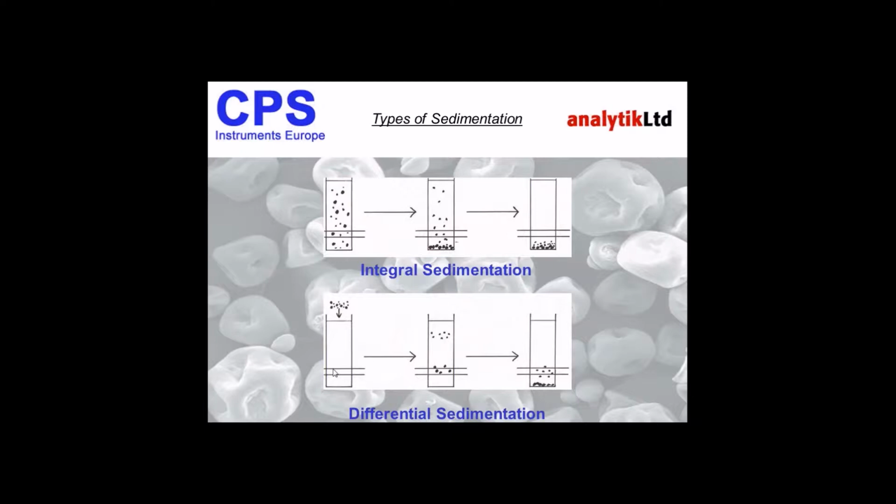Here, the intensity of the source signal is high at time zero, but as particles sediment and go in front of the light source detector, we reduce the light reaching the detector. So we are doing a very simple light measurement, attenuation of light, and this is going to give us particle concentration. We also use this to measure the time taken for the particles to reach the beam. By measuring the time, and provided you know the density of the particles, you can calculate the size diameter.